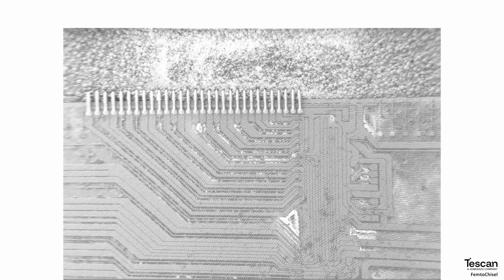We then move to SEM for higher resolution inspection of the exposed DRAM regions. At this scale, we can evaluate the visibility of traces and other fine structures and determine whether the preparation quality is sufficient for further analysis. These microscopy checkpoints are critical because the laser is not simply removing material continuously. Each major removal step is followed by inspection and verification.